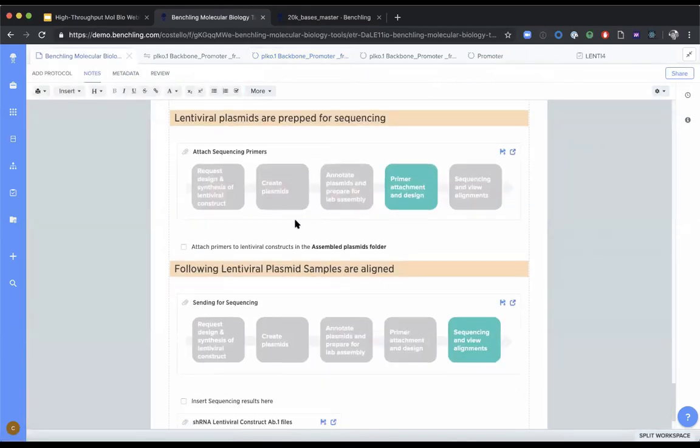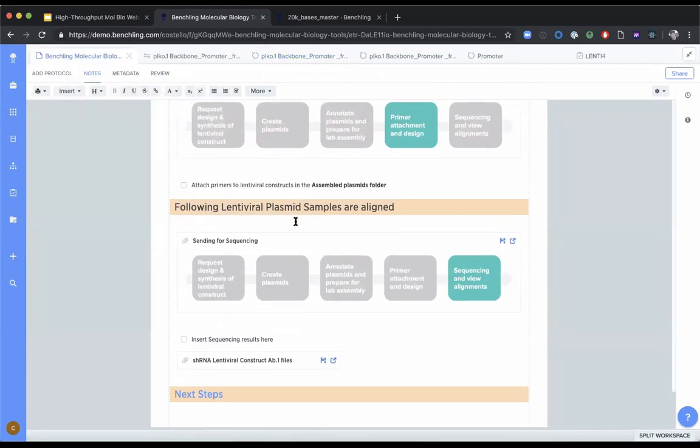Awesome. So now I've designed these primers in Benchling. Again, you could imagine I might go back to the bench. I now make my mixes of primers and mini-prep DNA following the instructions for the CRO that I'm submitting this to for sequencing. I prep my samples, I send them to sequencing. I patiently wait for my sequencing data to return to me. And then I can bring these AB1 files, for example, back into Benchling.